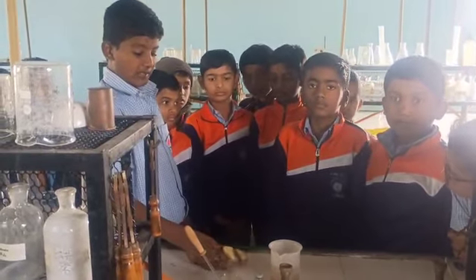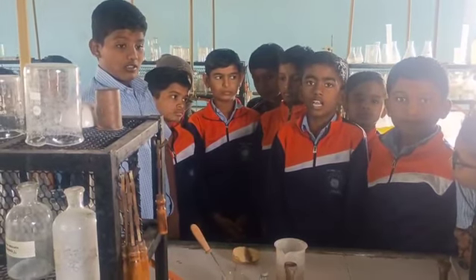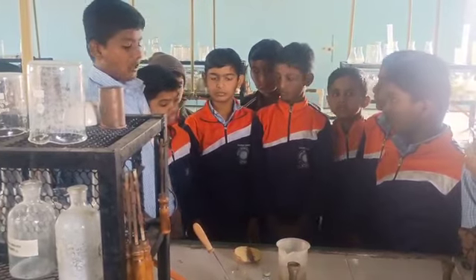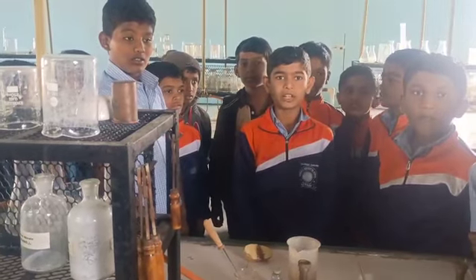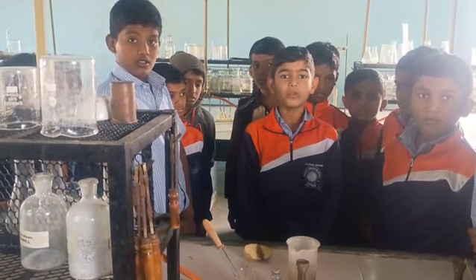Which materials contain starch? Jawar, bajra, sago, wheat, potato. What is the importance of starchy food in our life? Starchy food is important in our life. It gives more energy to our body and keeps it warm.